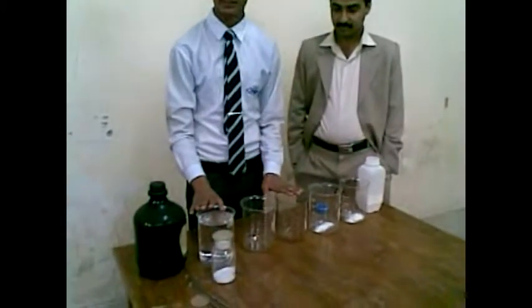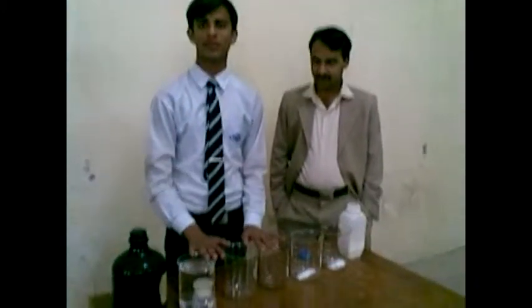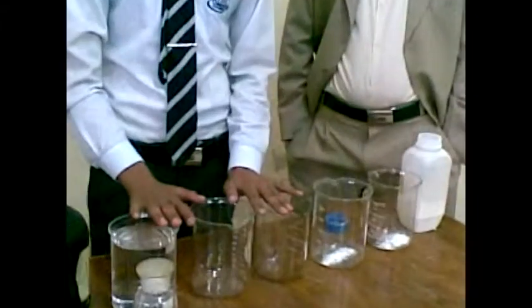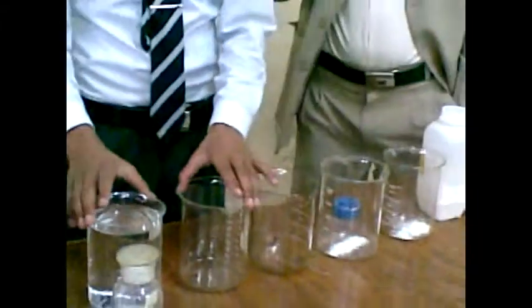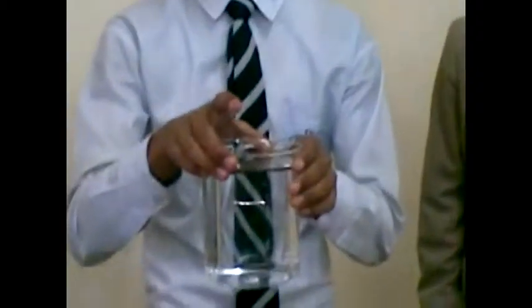Now, here are the five beakers and there are some chemicals. In this first beaker, it is water — simple water, H2O.